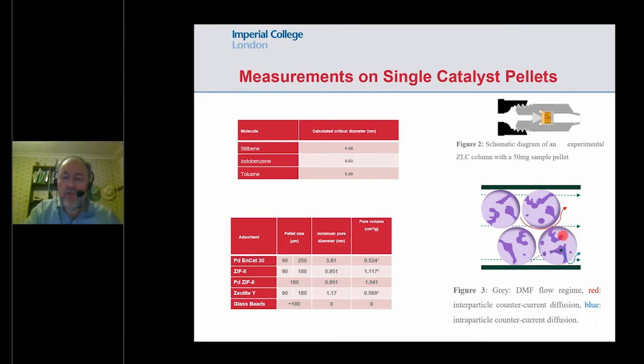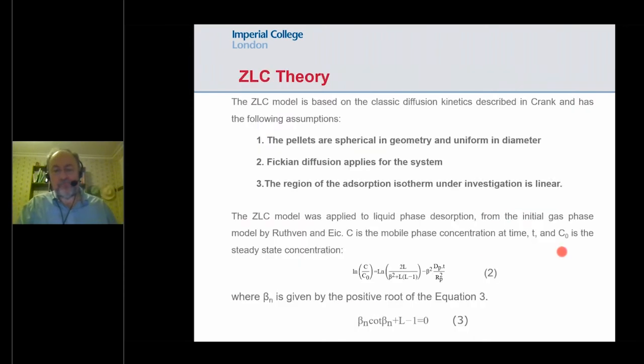So we're quite interested in understanding, can the reactant molecules diffuse inside the pores or not? And if they do diffuse inside the pores, can we estimate the diffusion constant? So that's what we're going to try to do in today's little project.